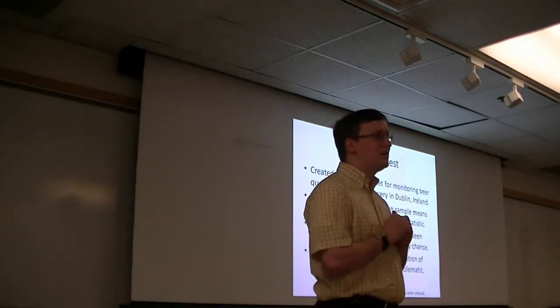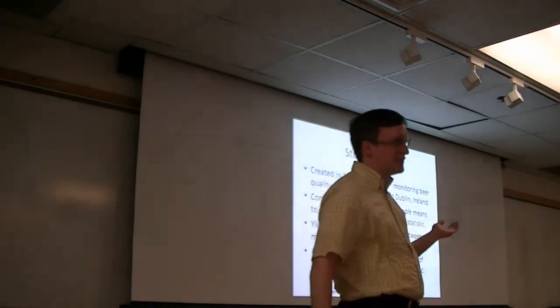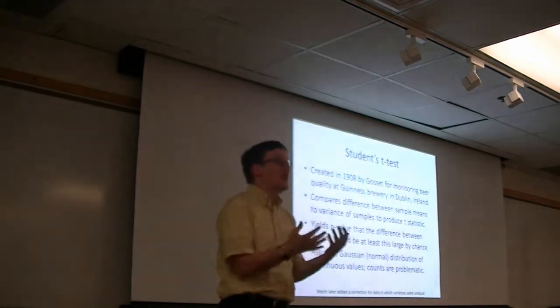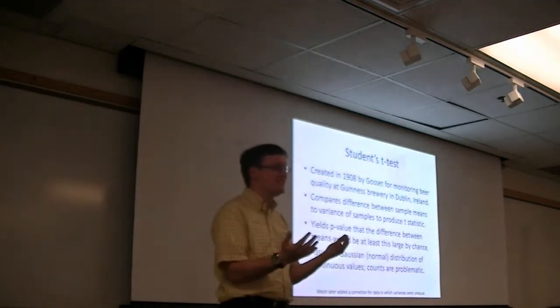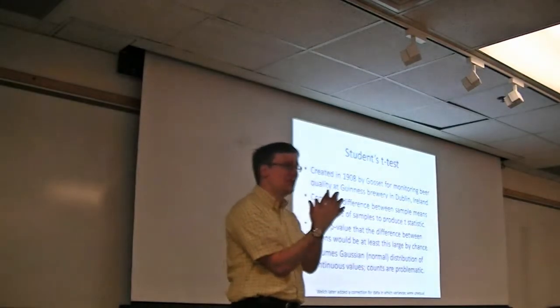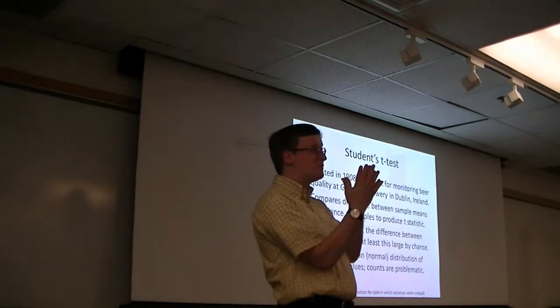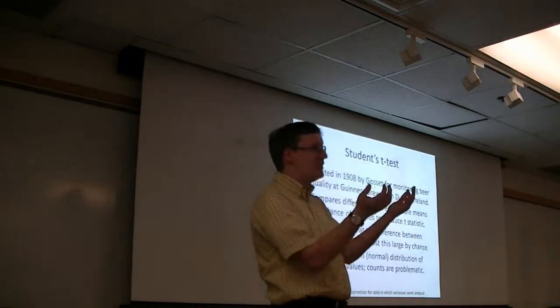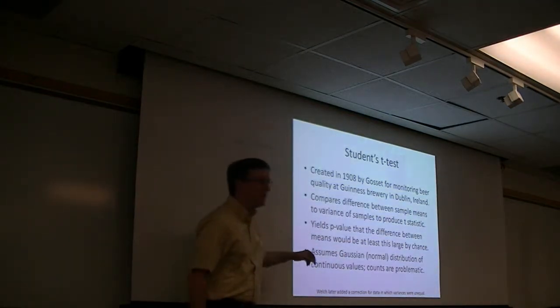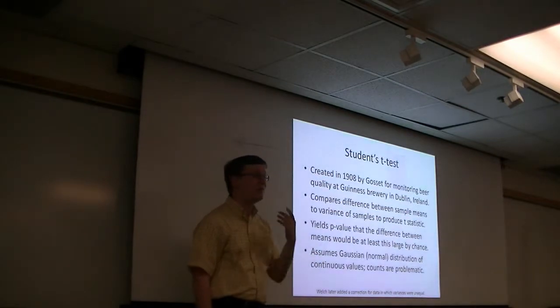The p-value does not enable you to accept your alternative hypothesis. What it does give you the ability to do is discard your null hypothesis. The null hypothesis is that there's no difference between these two distributions. So we want to evaluate the probability that by random chance the means would look this different given these underlying data. All right? So when we get a p-value out, it tells us whether or not what we're seeing is likely to have happened by random chance.